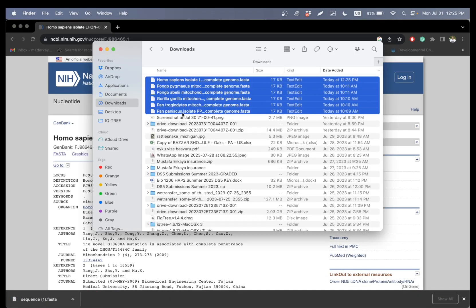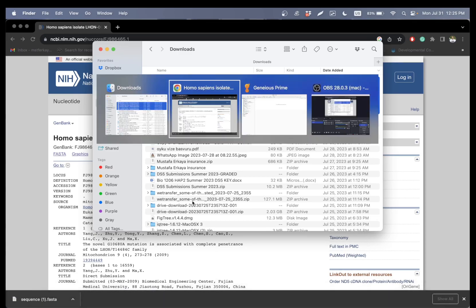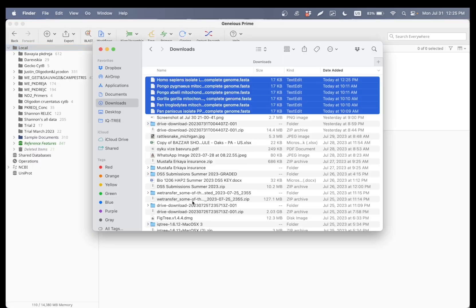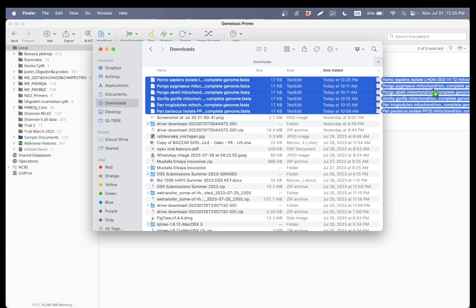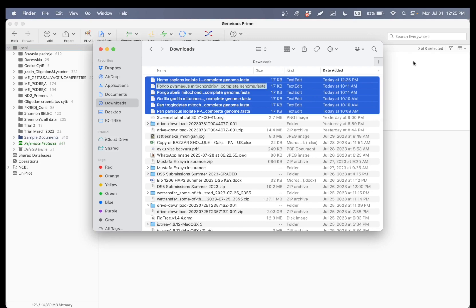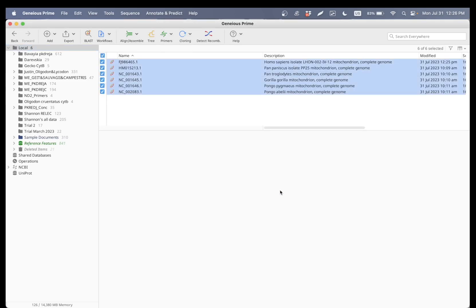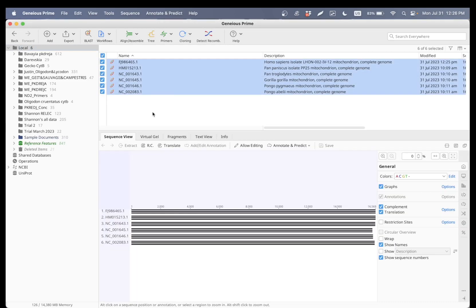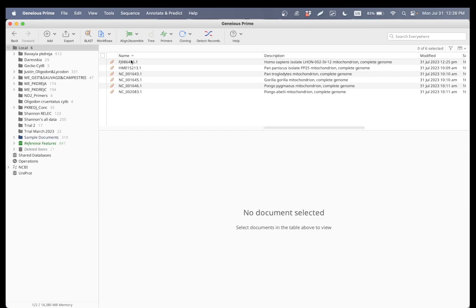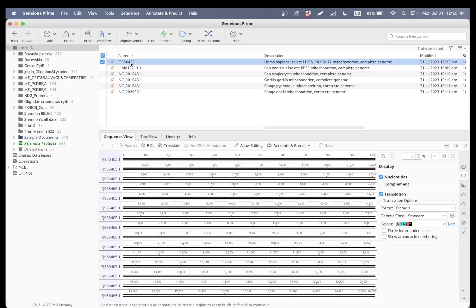As you can see, I already had five sequences and with the human now it's six. Once I drag it in, Geneious Prime is going to ask me if I want to keep the sequences separate — that's what I do all the time. And the next step will be renaming these.